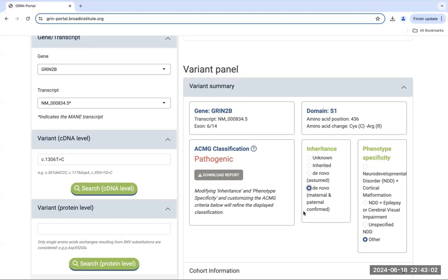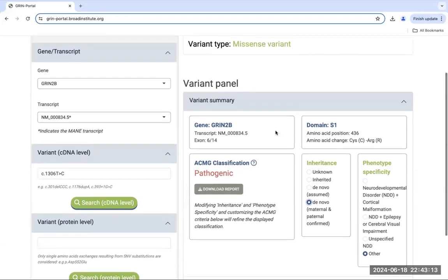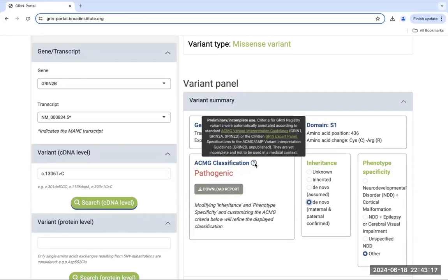Once the given variant information is selected and entered, we will now explore what information the variant analysis can tell you. Under the variant summary, the ACMG classification can be obtained, which is currently preliminary. Some information regarding the variant itself includes specifically the clinical significance.